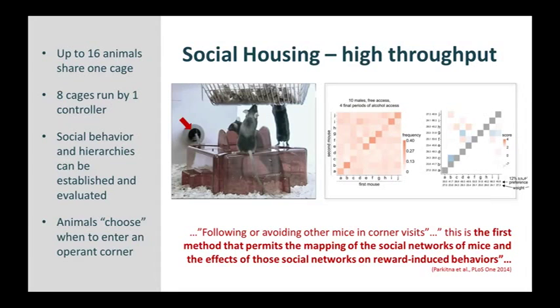Therefore, the social behavior and the hierarchy in the IntelliCage can be monitored and analyzed, such as the behavior of mice observing conspecific animals visiting a corner.